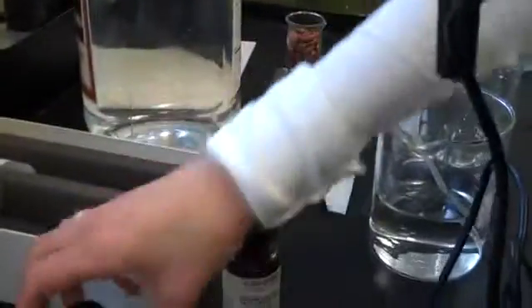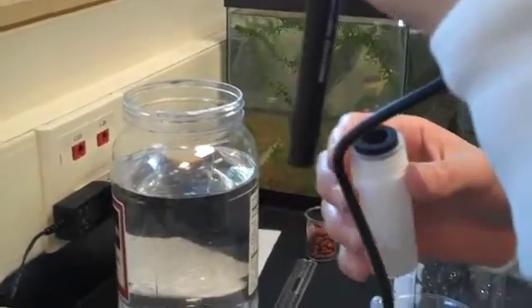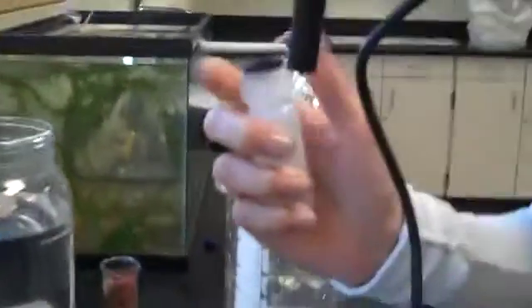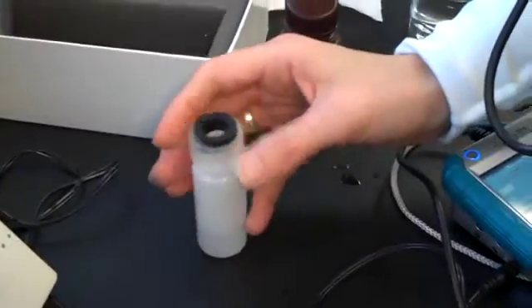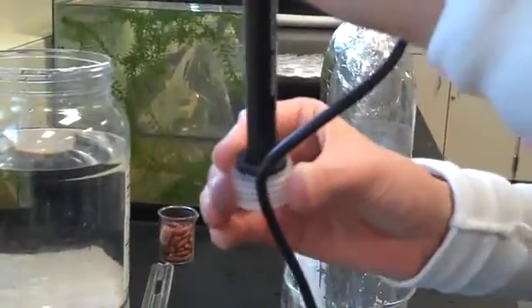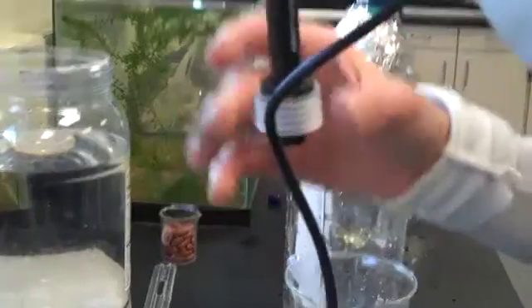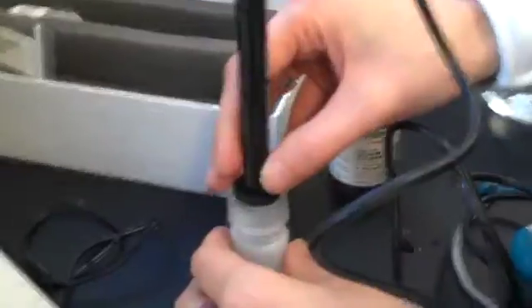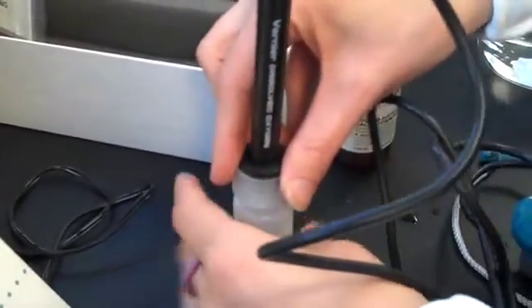Now we're ready to put it in the distilled water. It's important in this step that you actually don't get the probe wet on the bottom. The directions suggest that you take the lid off and then put the lid on so it's about a quarter of an inch covered, and then screw the lid on. That ensures that you don't accidentally get it wet.